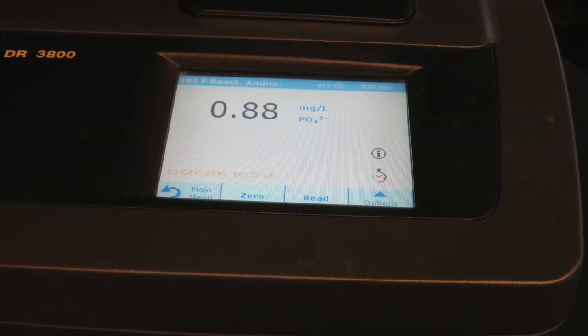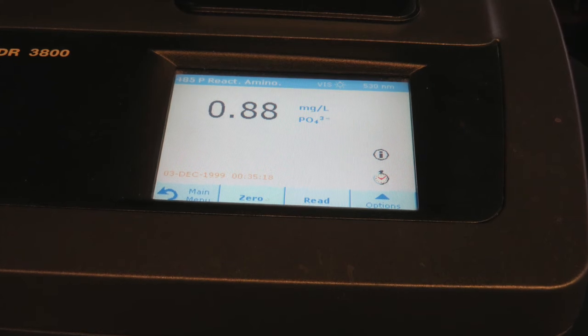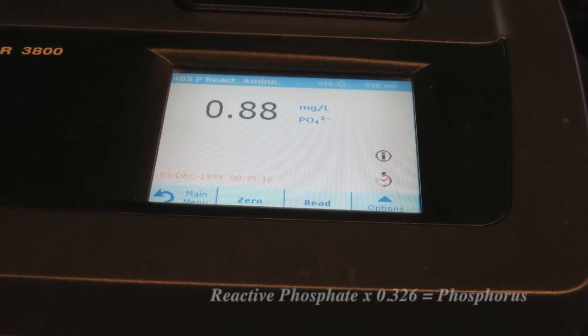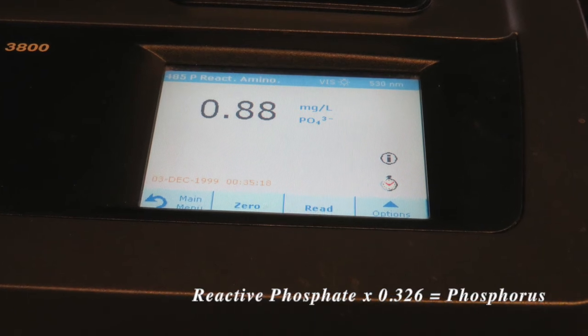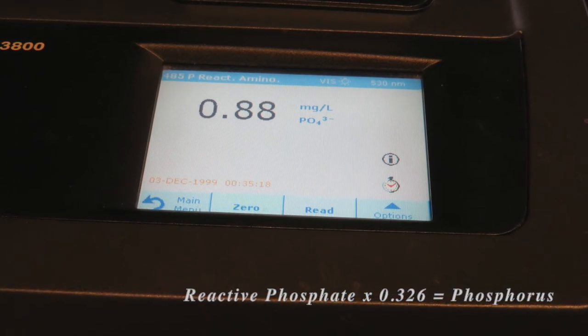The reading is 0.88 milligrams per liter. You can multiply this result by 0.326 to obtain milligrams per liter of phosphorus.